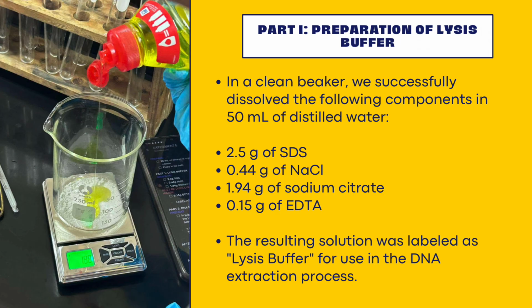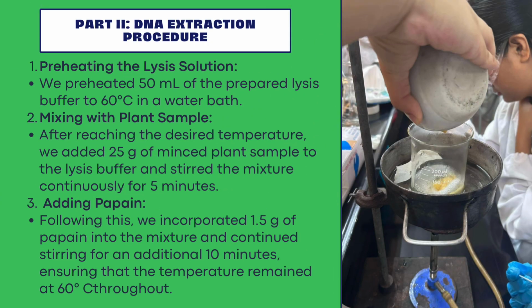Next, Part 2, DNA extraction procedure. Step 1, preheating the lysis solution. We preheated 50 ml of the prepared lysis buffer to 60 degrees Celsius in a water bath. Step 2, mixing with plant sample.